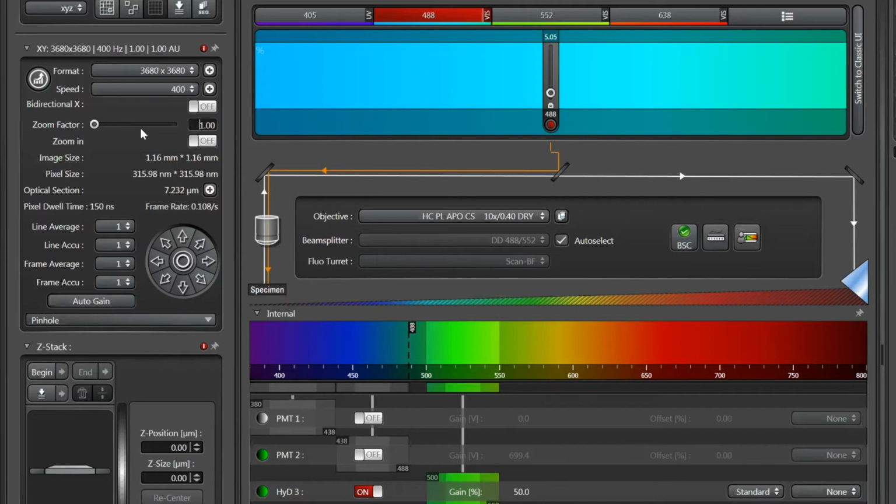And now you changed the zoom a little bit. So if you go back to that button, it will actually have a different number of pixels because we have a different field of view. Gotcha. So it's all smart. It knows, it's looking at the exact field of view. It's reading the objective that you're actually using and knows the settings for each objective. Everything like that. It all optimizes it based on your current settings.